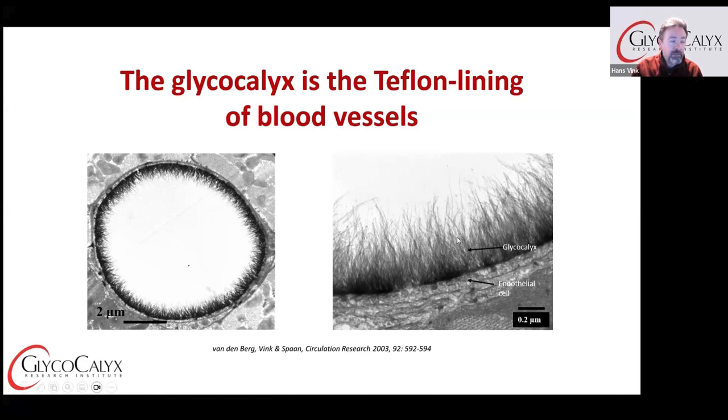So it took a long time to develop a protocol by staining these structures with Alcian blue, which is a cationic dye that binds to the negative charges on the polysaccharides. And then staining also encapsulated the polysaccharides with the dye molecules and stabilized the structures at the same time. And then if you dehydrate, the structures keep standing and show up in the pictures. But it has quite a few challenges. Those are really beautiful images. Yeah, it took a long time.